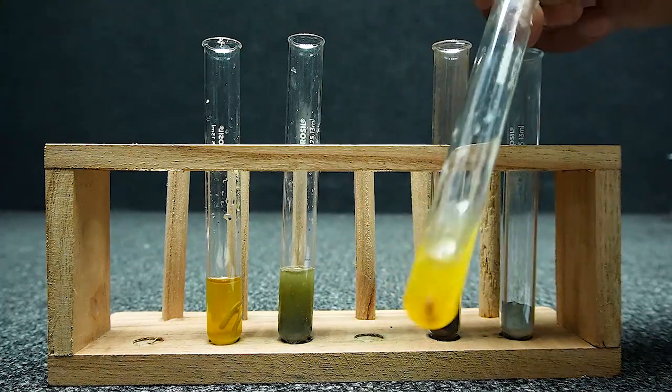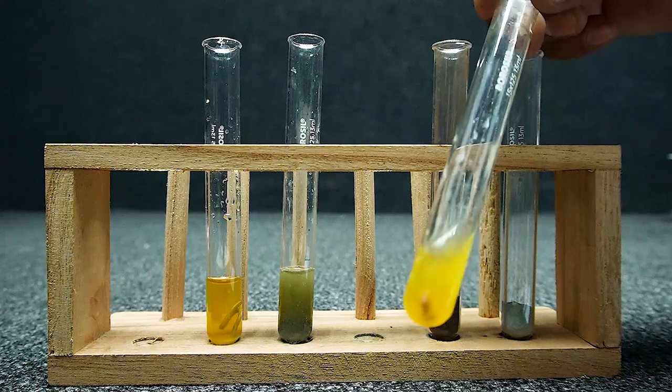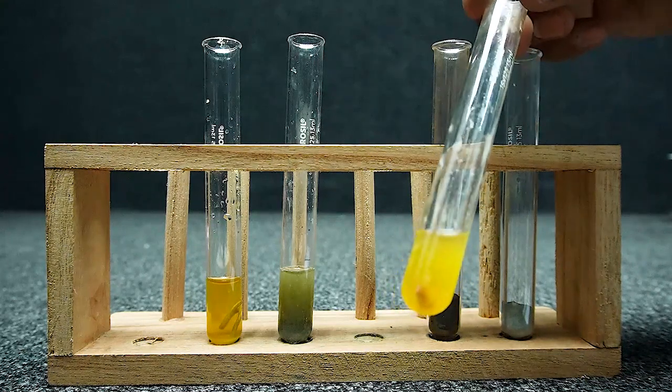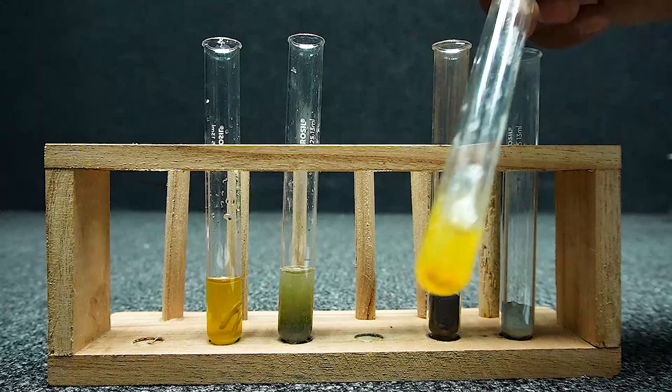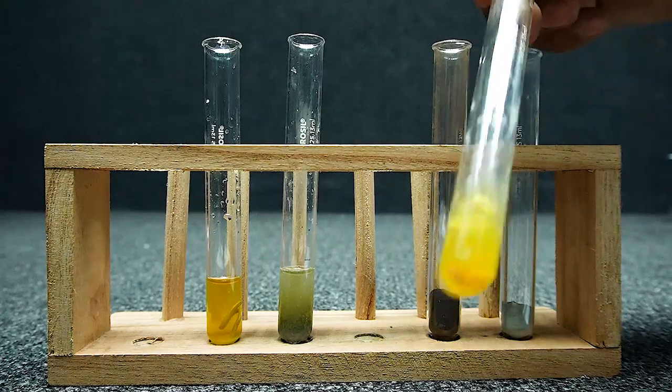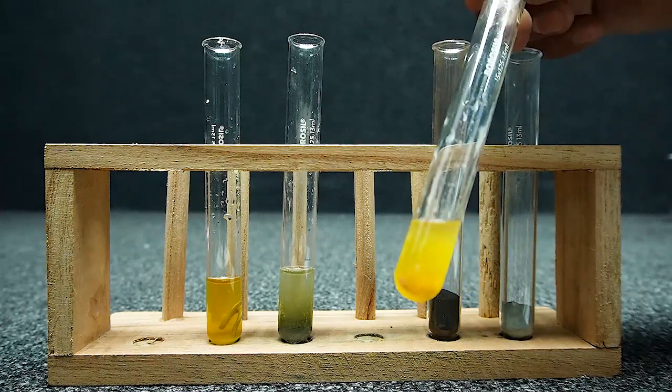There is no color change of iron sulfate with copper. So copper has not displaced iron.